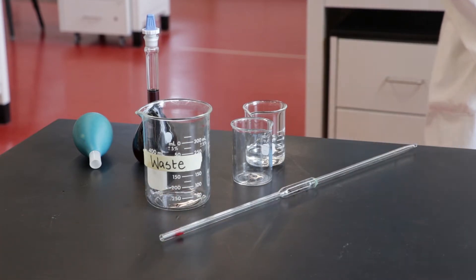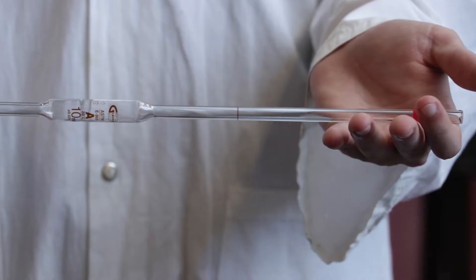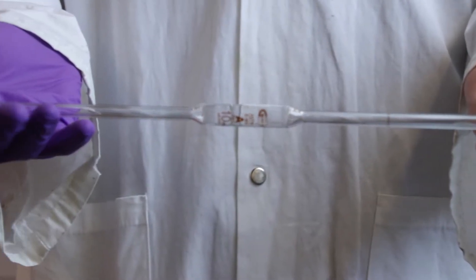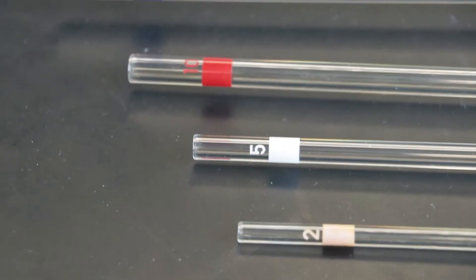In this video we will demonstrate how to use a volumetric pipette. Volumetric pipettes deliver accurate volumes of a solution from one vessel to another. They come in a range of volumes including 5, 10 and 25 milliliters.